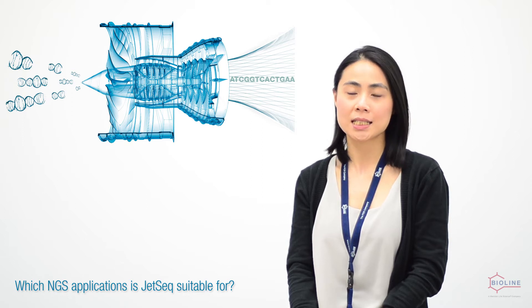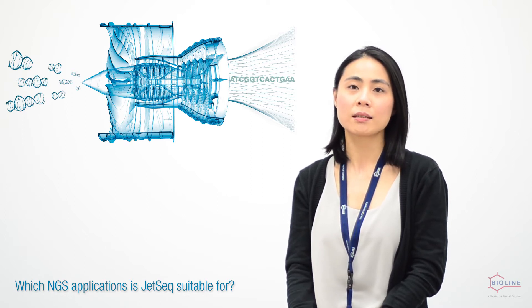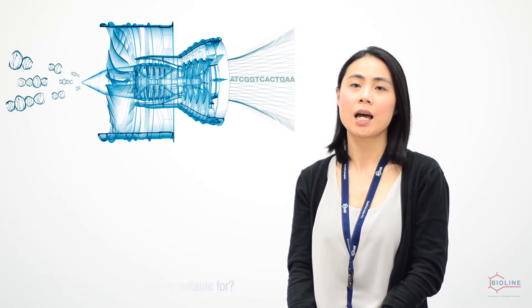Gizzer kits can be used for target sequencing, whole genome sequencing, de novo genome sequencing, exome sequencing, and ChIP sequencing.